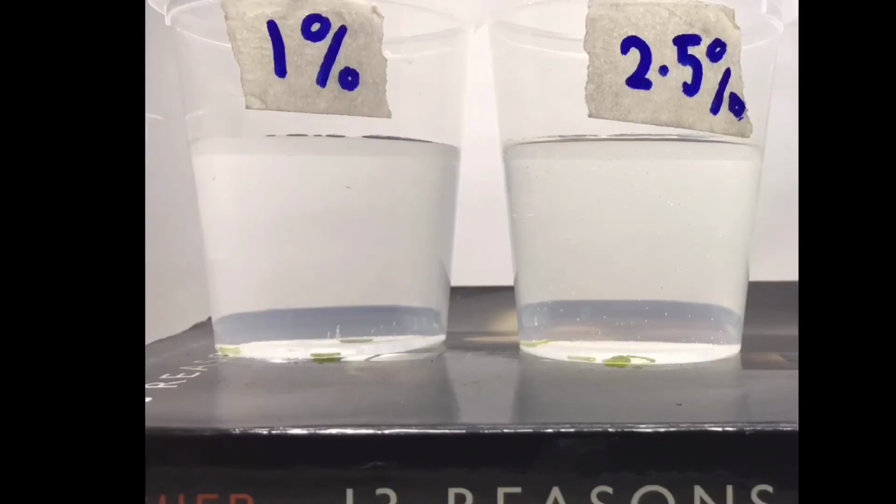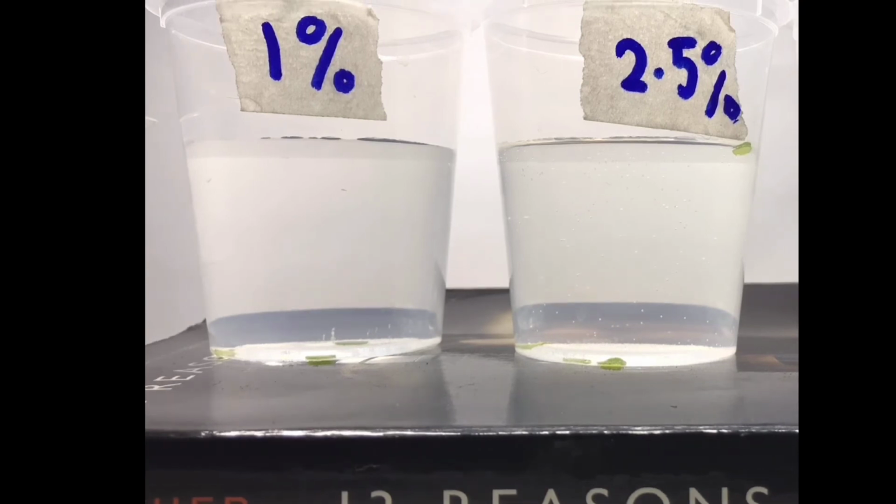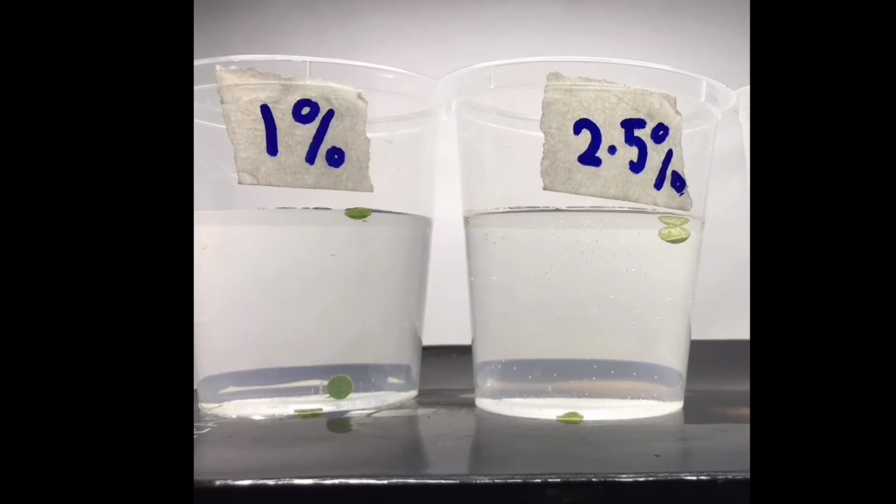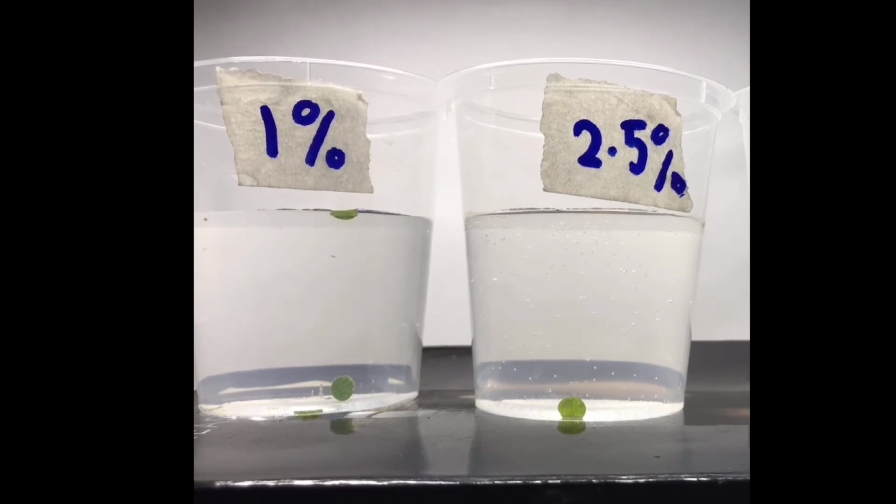The sodium bicarbonate that is added into the water will supply carbon dioxide, and the bicarbonate ion acts as a carbon source for the photosynthesis. Hence, the light source, which is the table lamp, will provide the light energy for the thylakoid membrane of the leaf to carry out light-dependent reaction, producing oxygen into the interior of the leaf disc in the form of air bubbles. The air bubbles around the leaf disc will create a buoyancy which then helps the leaf to float in the solution.